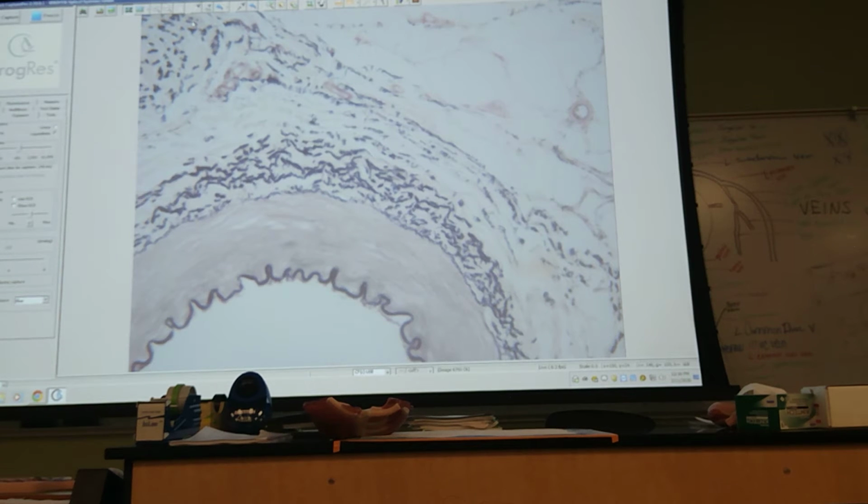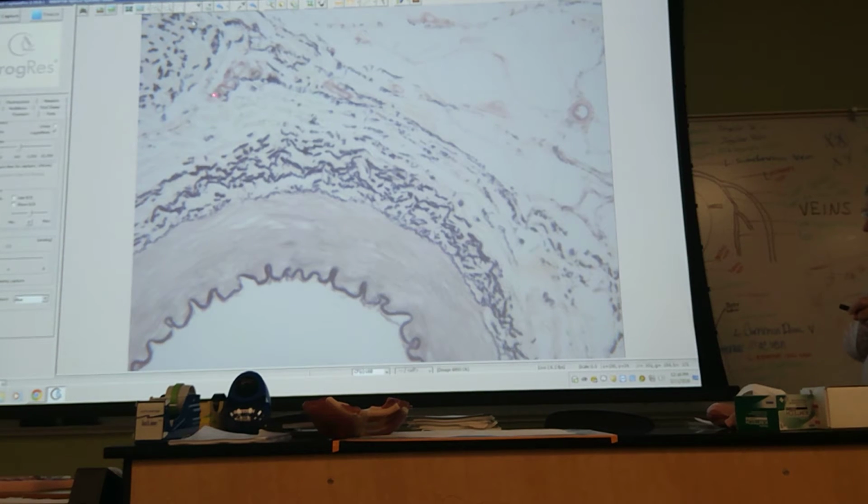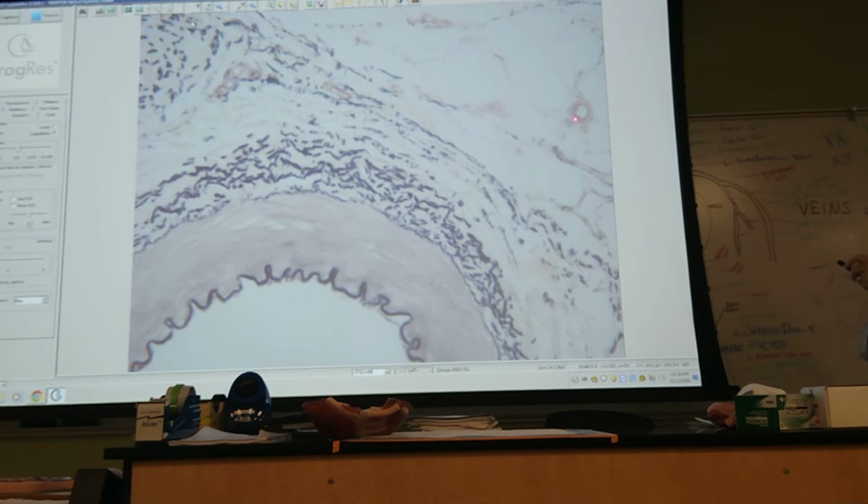And you can see those. I stopped here because you have a nice little cluster. And they look like little tubes. Here's several over here. There. And there. Again, it has to have a lumen. There's even a tiny little one right there. Here's one right here. This is actually a small-ish artery, so that really wouldn't classify as a vasa vasorum.